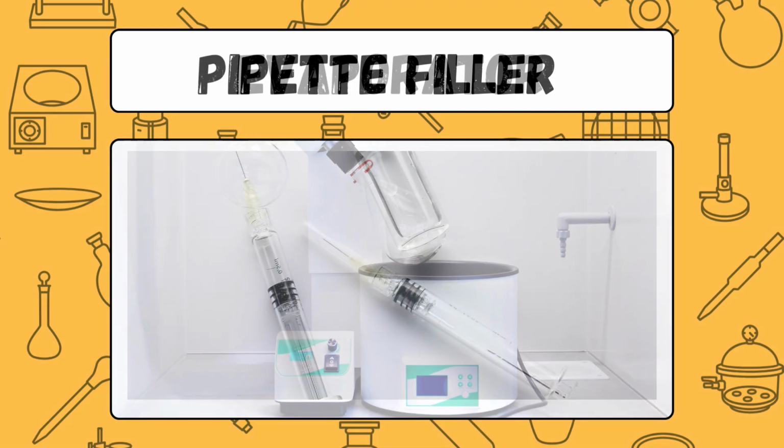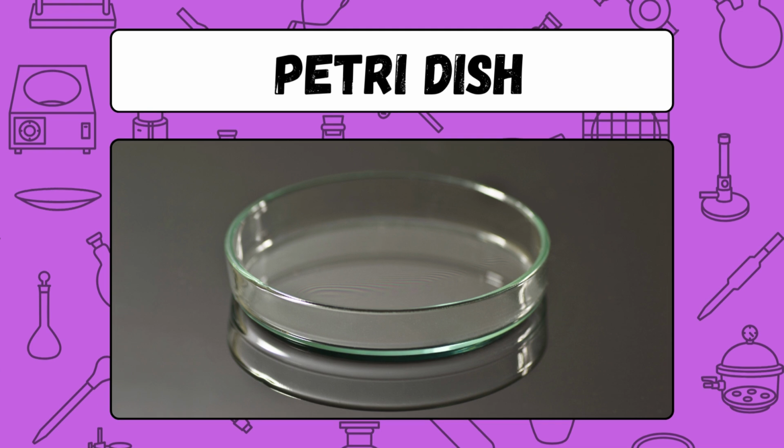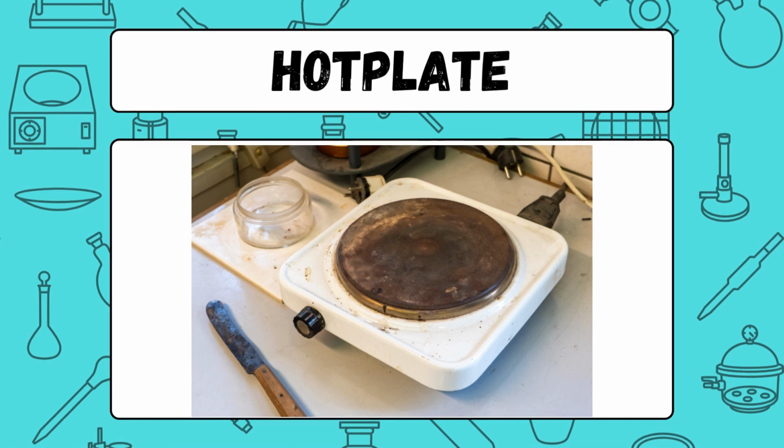Pipette filler. A pipette filler is a rubber or plastic device used to safely draw liquid into a pipette by creating suction. Petri dish. A Petri dish is a shallow, flat dish made of glass or plastic used to culture microorganisms or grow cells.